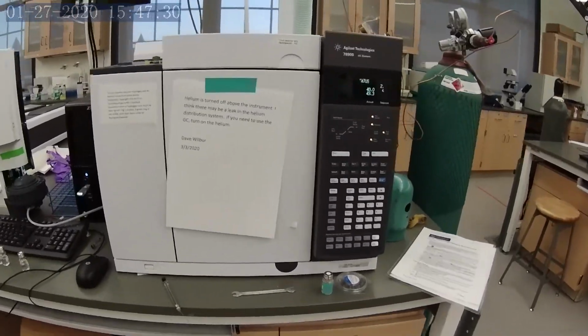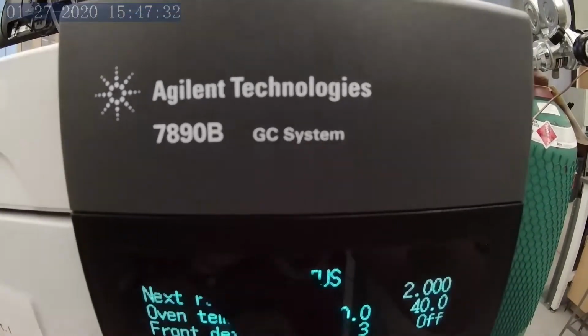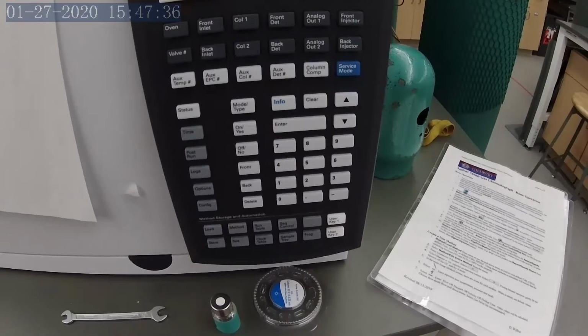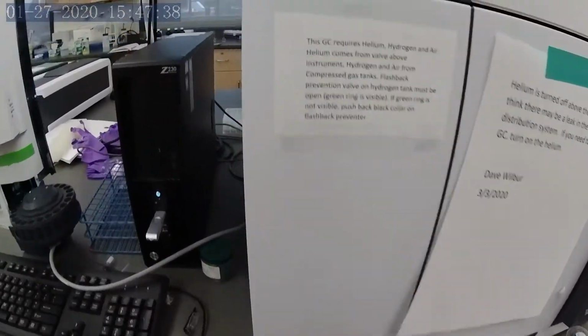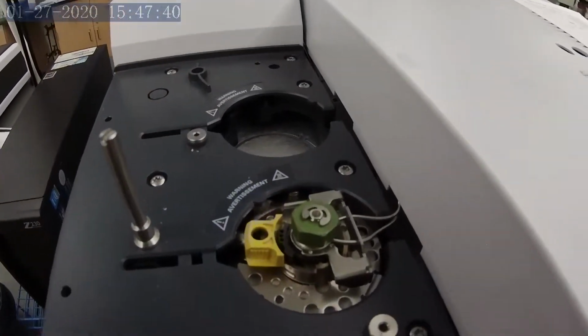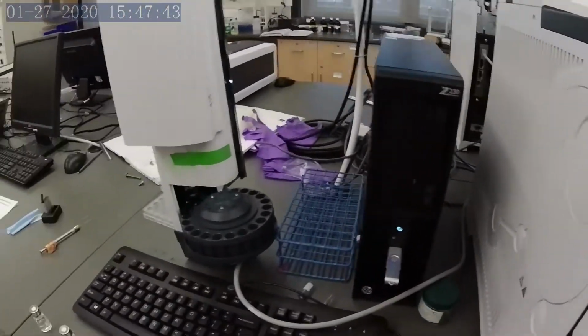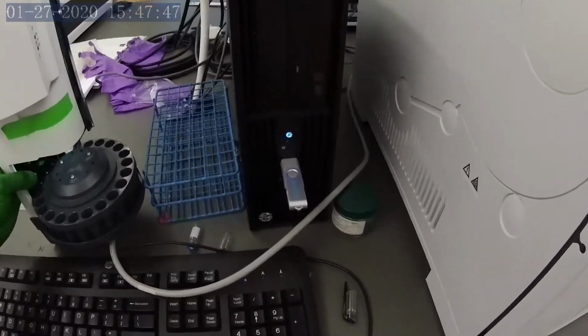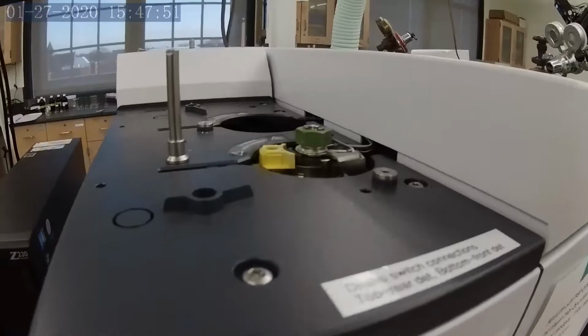Here I'm just giving an overview of the GC system. So it's a 7890B from Agilent. The runtime is going to be 2 minutes at 40 degrees oven temperature. I took off the sampling tower. Usually these things have autosamplers on them, but I couldn't find the right size vials that go into this thing, so we're going to have to do a manual injection with the needle.